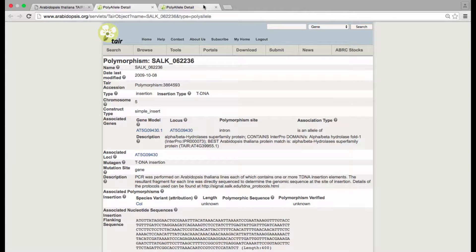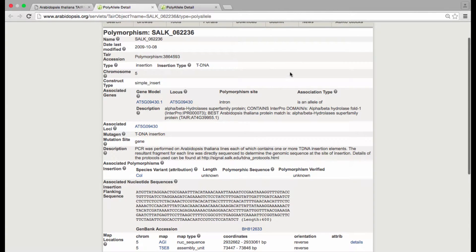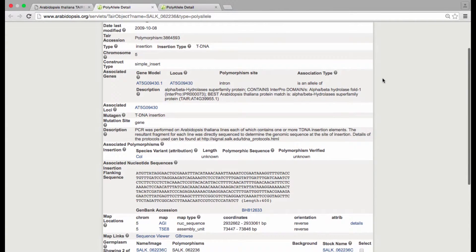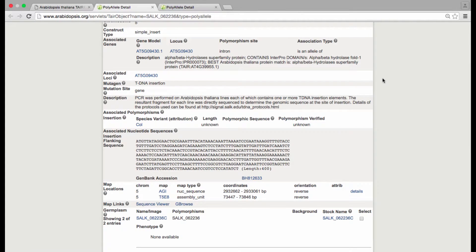There's a lot of information here: flanking sequence data, curated information about the mutation if it's been described in the literature, and a list of germplasms containing the allele.